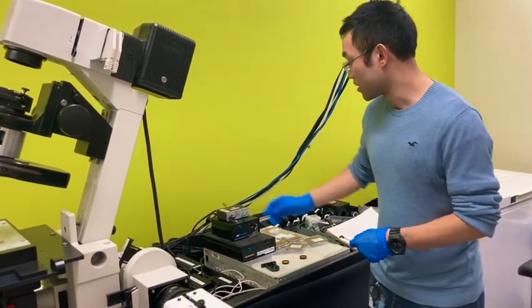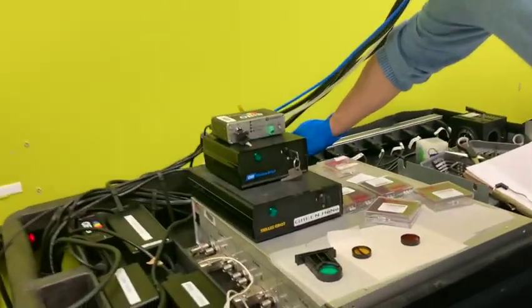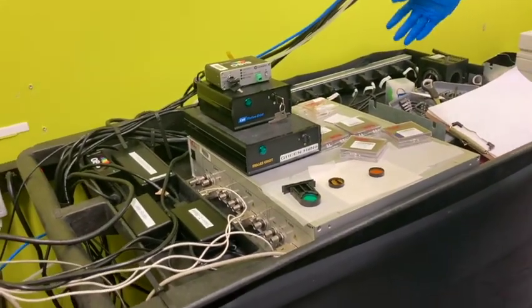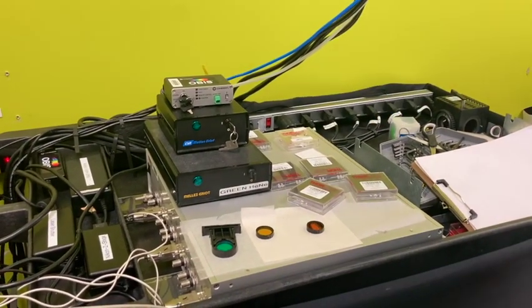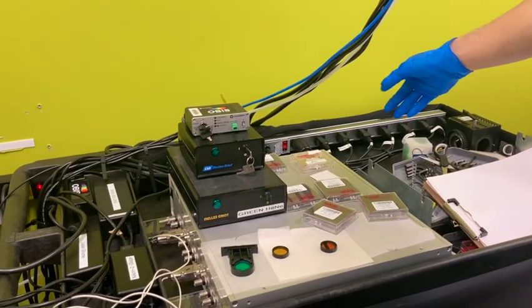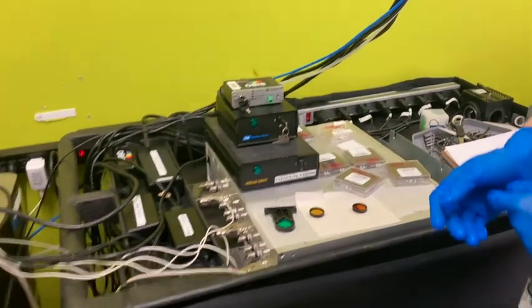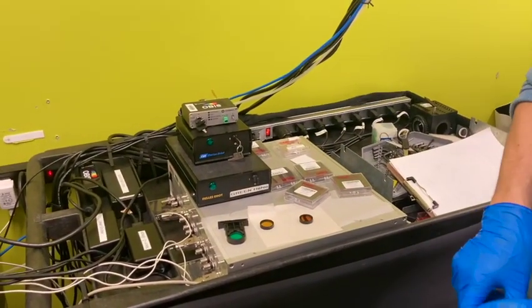So we start from the illumination here. I made a switch for all of this. Everything is connected to this main power. The computer is not; the computer has a separate power, so you don't need to turn the computer off every time. But these need to be on at the beginning.